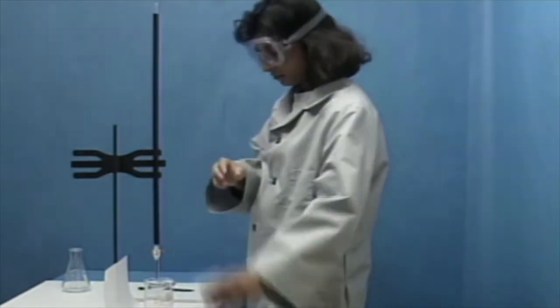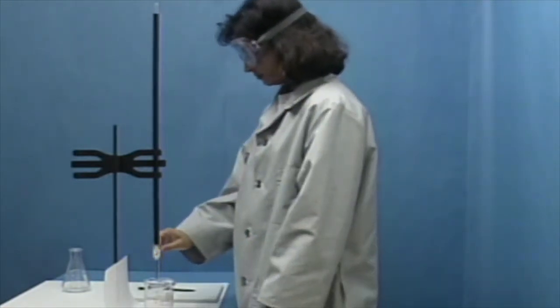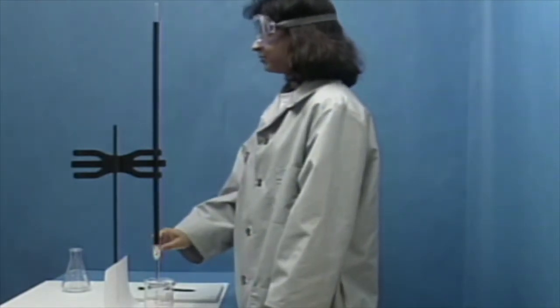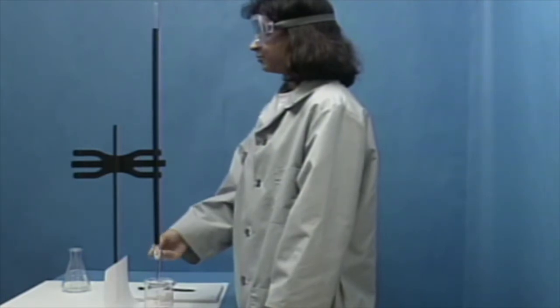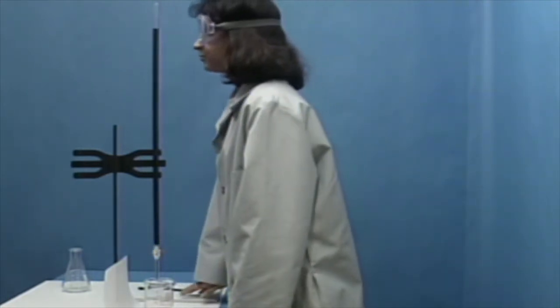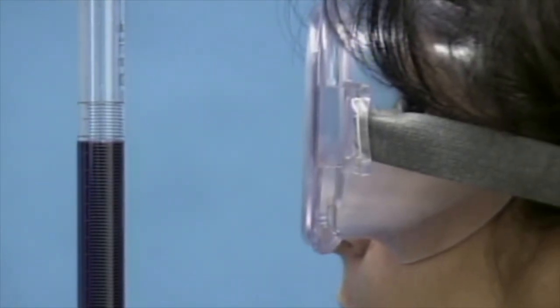In a titration, you measure the quantity of one reactant that is required to consume all of another reactant. To accomplish this, you measure the volume of liquid released from the burette during the procedure.